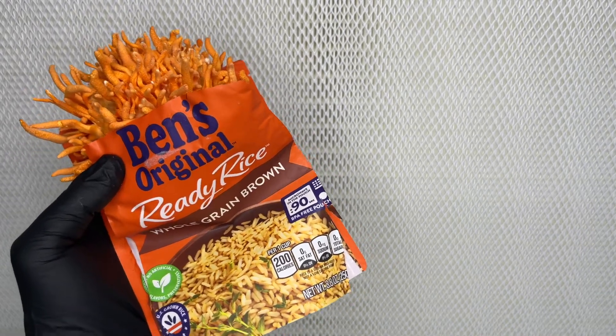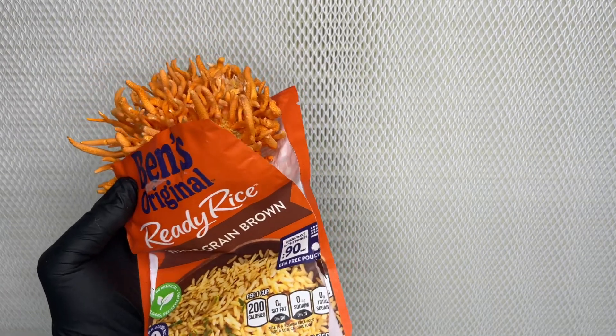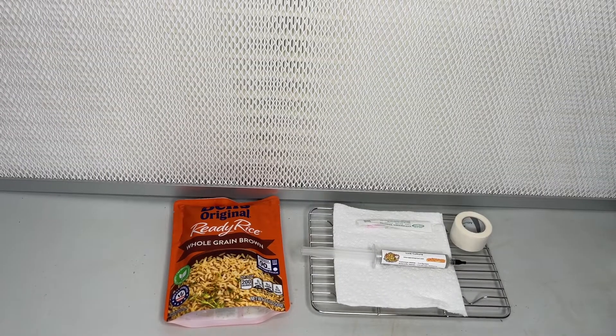Welcome back to Spore and Sprout. In this video, I'm going to show you how to grow Cordyceps Militaris using Uncle Ben's Ready Rice. Brown rice is one of the best substrates for Cordyceps, so this method is perfect.